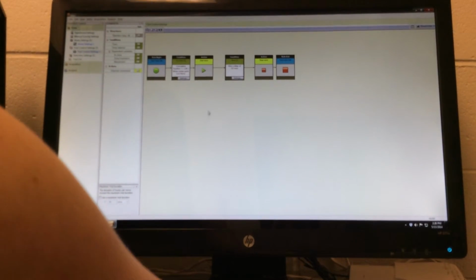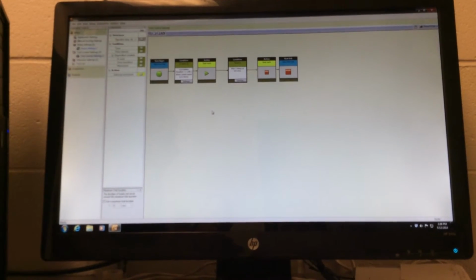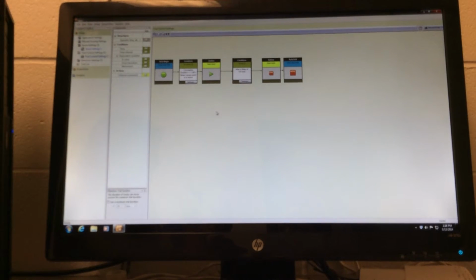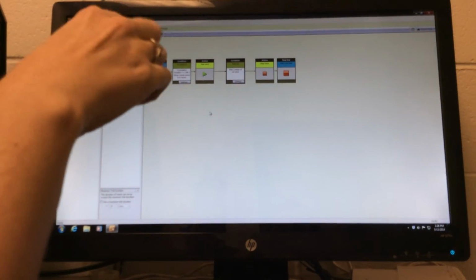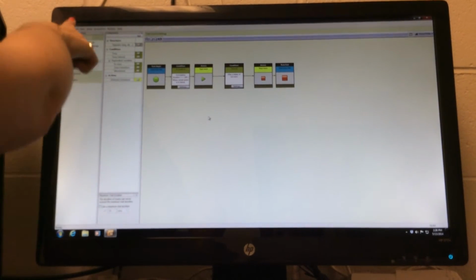You can have multiple trial control settings. You can have multiple arena settings. So if you're doing something like using the dry land maze in the next room and the location of your food changes each time, you can have multiple arena settings.